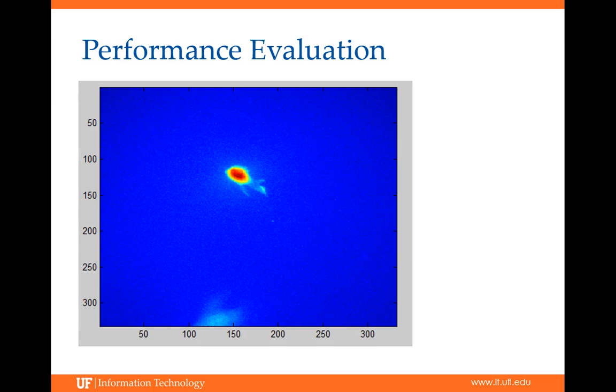Okay, here comes the most important part. This is a program, and this picture shown here is not the original picture. This is a picture after I determined the threshold. We can see the cells are highlighted in the middle, and the intensity decreases from the middle to the side.